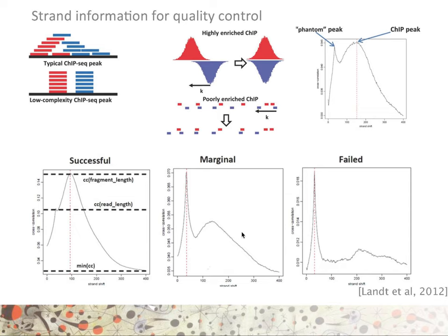In the middle panel, we have a more marginal experiment where there is a ChIP peak, but the phantom peak is much higher. Finally, in the last panel, we clearly have a failed experiment where we hardly see any peak, but we also have a clearly high phantom peak.